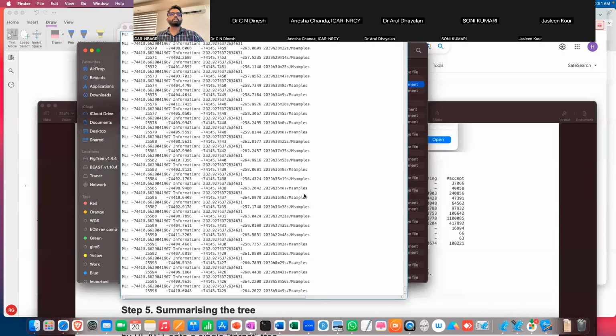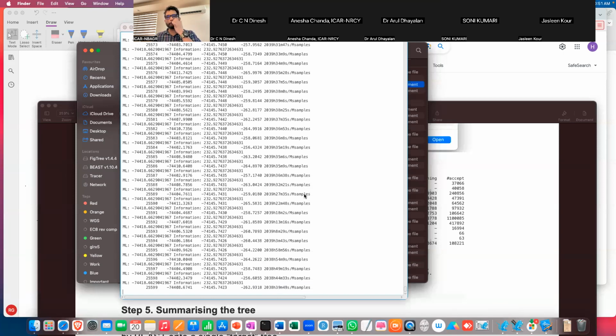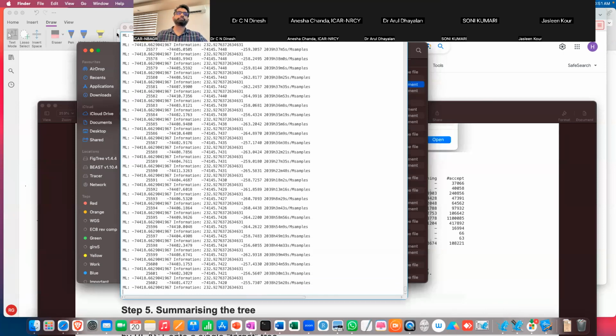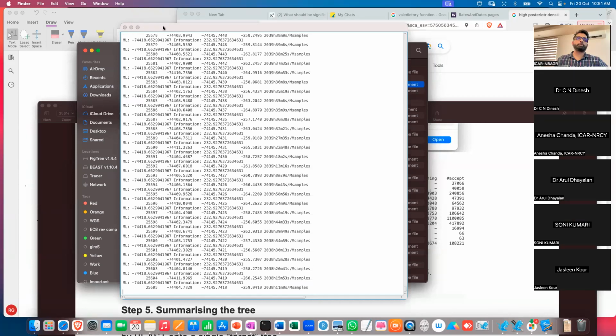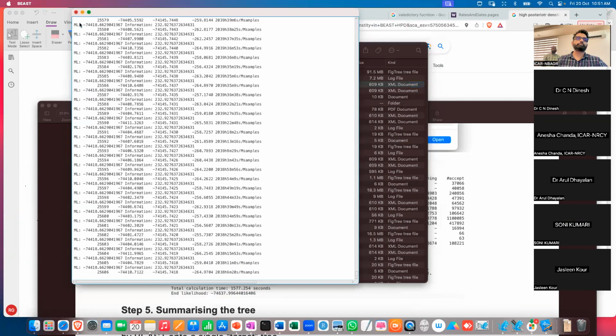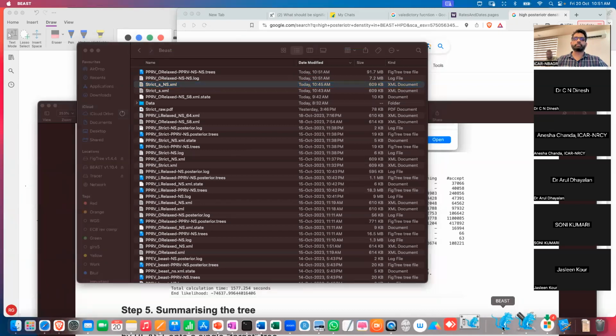Okay, guys. See, BEAST is running. I'll just stop this. How long does it take to process? That depends on your computer. I'm just closing that.